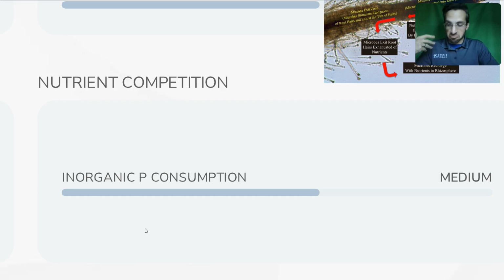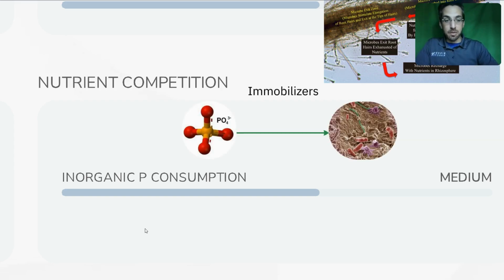Conversely, here we again have immobilization. This is microbial demand for the very same soluble phosphate that our plant needs to take up; these are immobilizers. And so if you have an imbalance in favor of immobilization, then you risk a bottleneck. In this case, because phosphorus does not leach, it erodes, there's no concern at having very high solubilization and mineralization and very low immobilization.